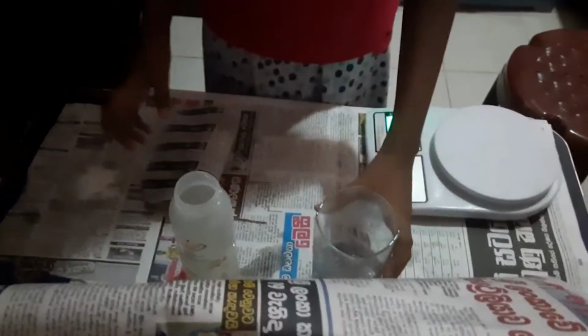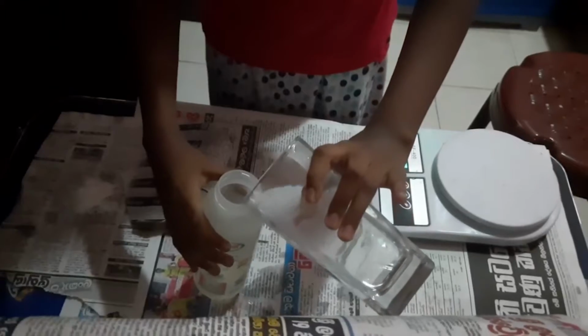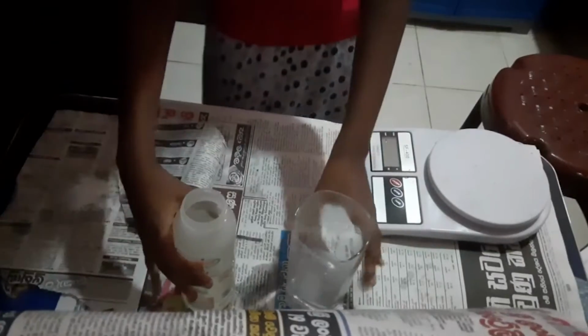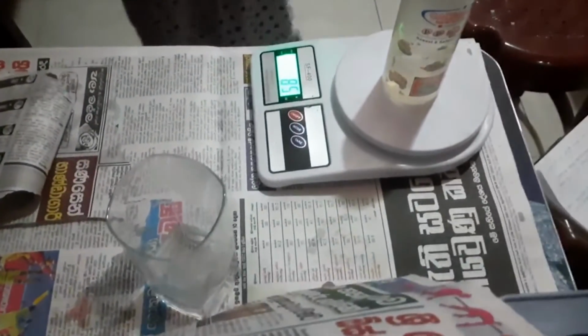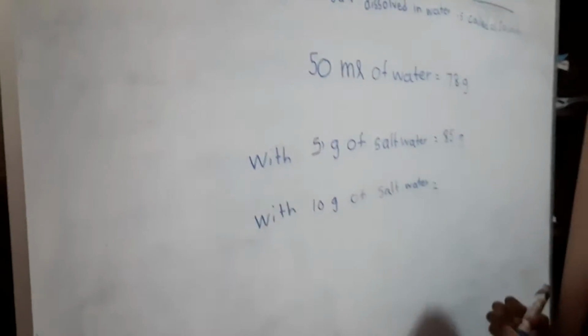And I add water till it becomes 50 milliliters. Now I measure the mass of this solution. It is 85 grams. Now I remove this solution.